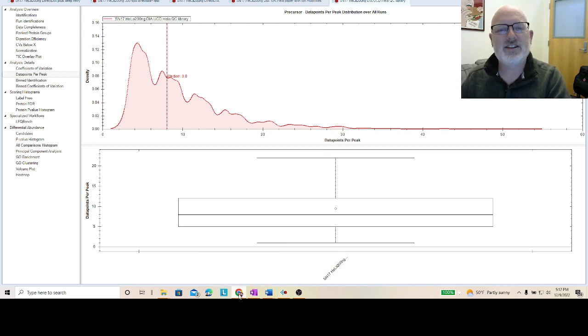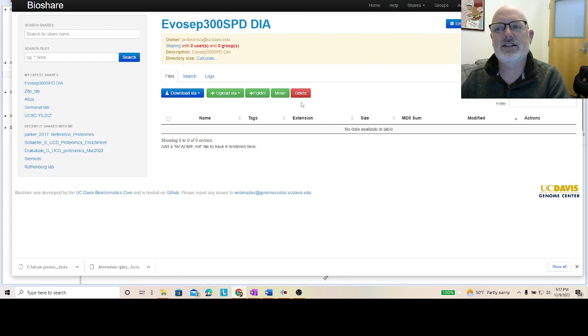So if anyone wants to look at this data, I'm going to upload everything here. This is our UC Davis Genome Center BioShare directory. This is how we give data back to people. You've probably seen it before. It will be on this link, so you can pause the video and write this down. I'm going to zip up everything and put it here so you guys can download it and play with it yourself if you're super bored.